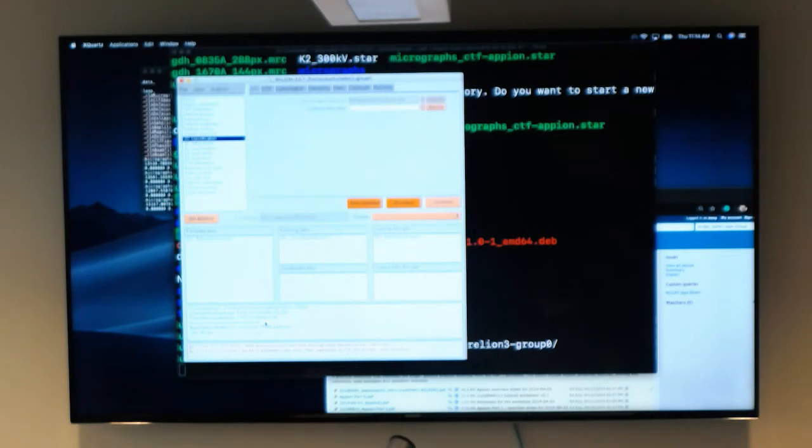Okay, so what do we want to do? Yeah, it's there. You can just type it out instead of finding it. That's the one you wanted, right? Yeah.